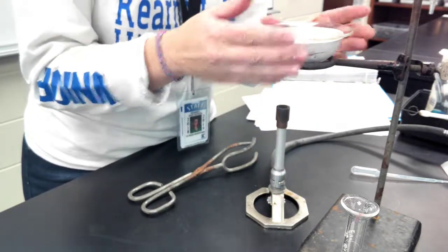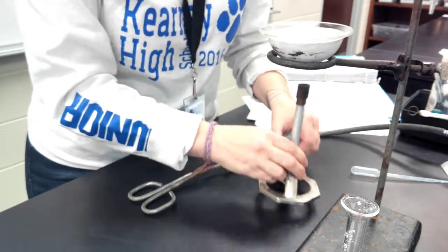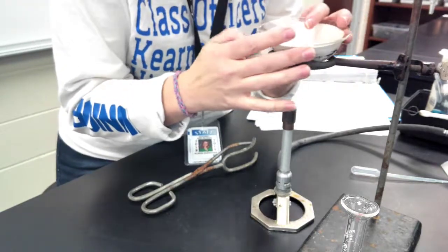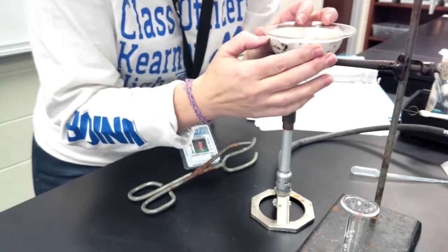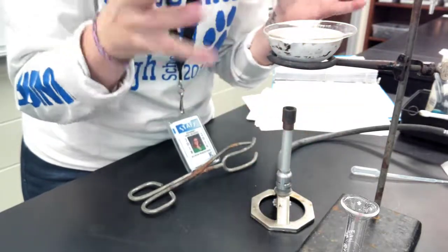And whenever I start heating, I always toast. Toast, toast, toast. Gently, gently heating. And then I'm going to heat strongly. I'm going to watch it. Pay attention so that the mouth of your evaporating dish is not pointing at you, it's not pointing at a table partner.